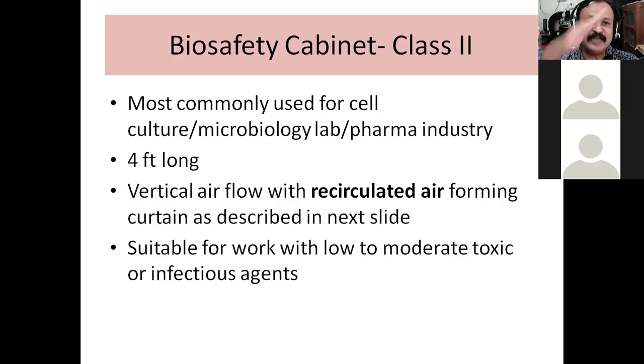Although this air is flowing through the cabinet, there is some material we are placing, we are working in that cabinet, we may be handling microbiological cultures. And therefore the air which is going out of the cabinet may carry microorganisms, isn't it? It is going to carry microorganisms.